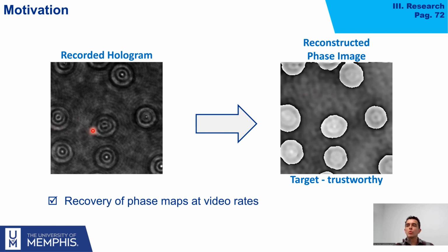when you are working with off-axis digital holographic microscopy, one of the most important features is that it's a single shot technique. Single shot technique means that you can retrieve information in real time or at video rates. However, the conventional algorithms don't allow retrieving phase images at video rates free of aberration.